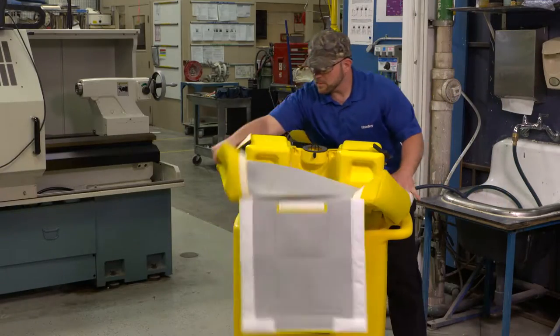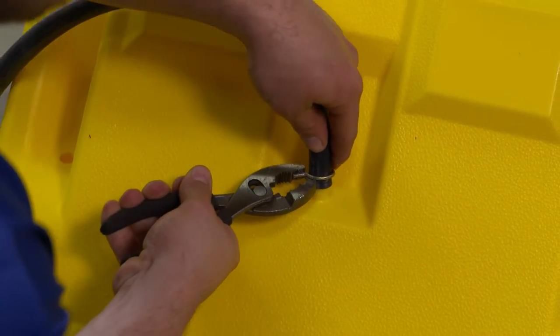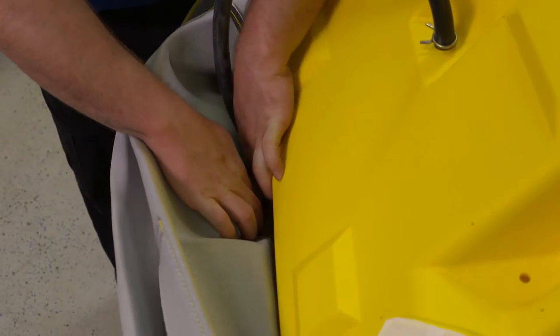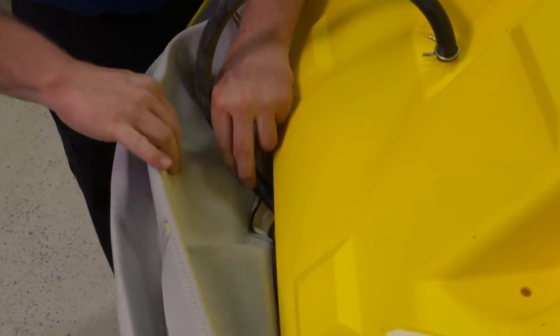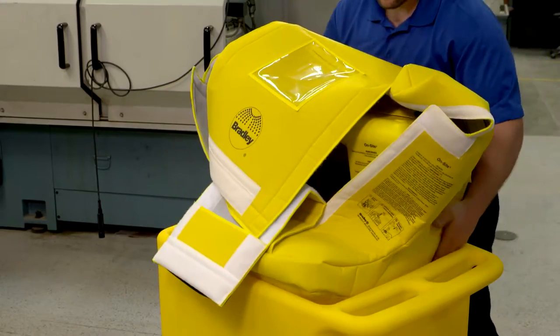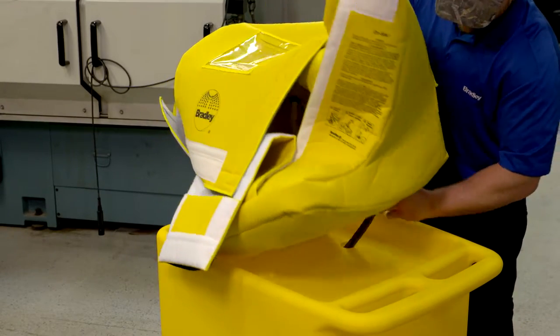To begin installation, take the pedestal and place it on top of the cart. Attach the drain tube to the bottom of the pedestal with the clamp. Insert the tube from the drain hole at the bottom of the pedestal through the hole in the back of the heater jacket. Feed the tube into the hole on the cart that is closest to the back of the eyewash unit.